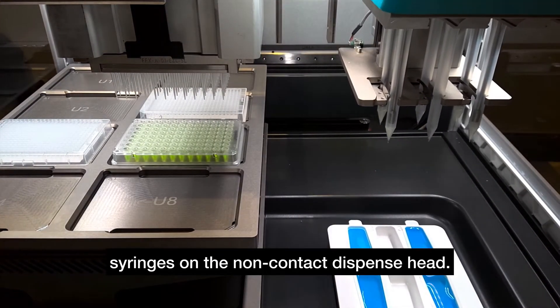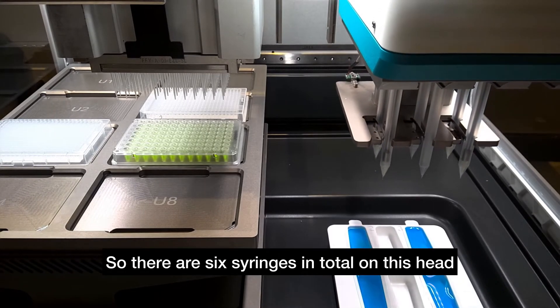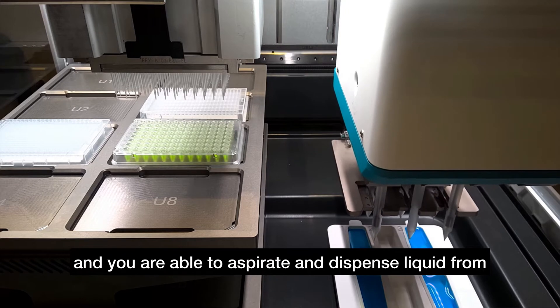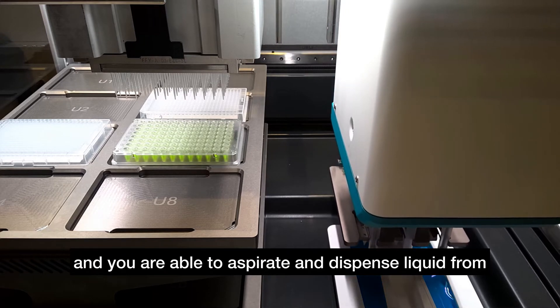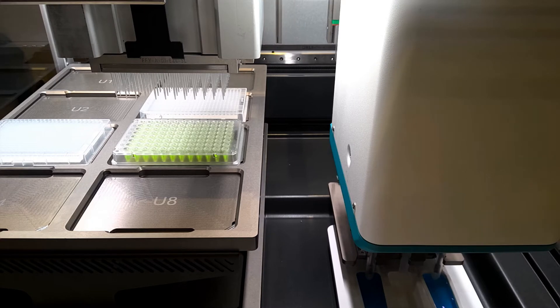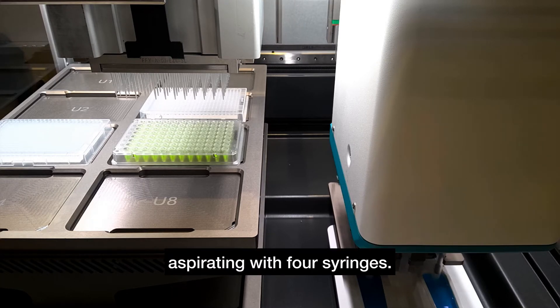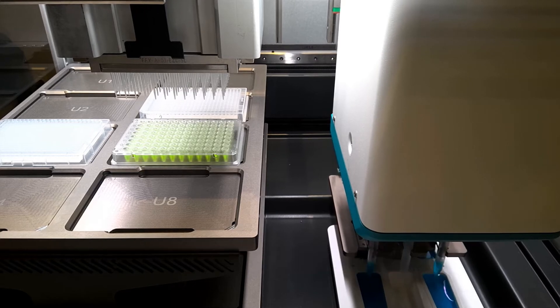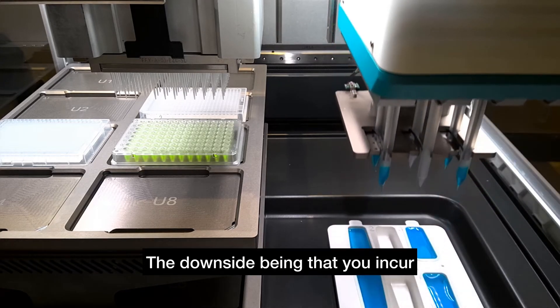There are six syringes in total on this head and you are able to aspirate and dispense liquid from any number of syringes from one to six. In this case we're aspirating with four syringes. The benefit is that you can go faster—the more syringes used for a particular liquid, the faster you can dispense. The downside is that you incur extra dead volume for each trough.